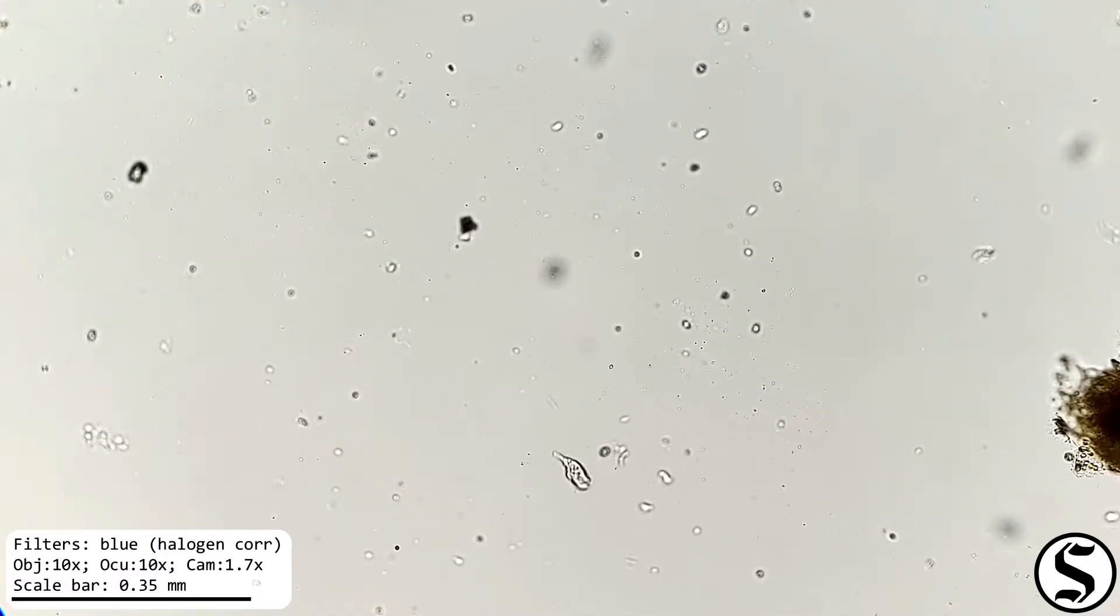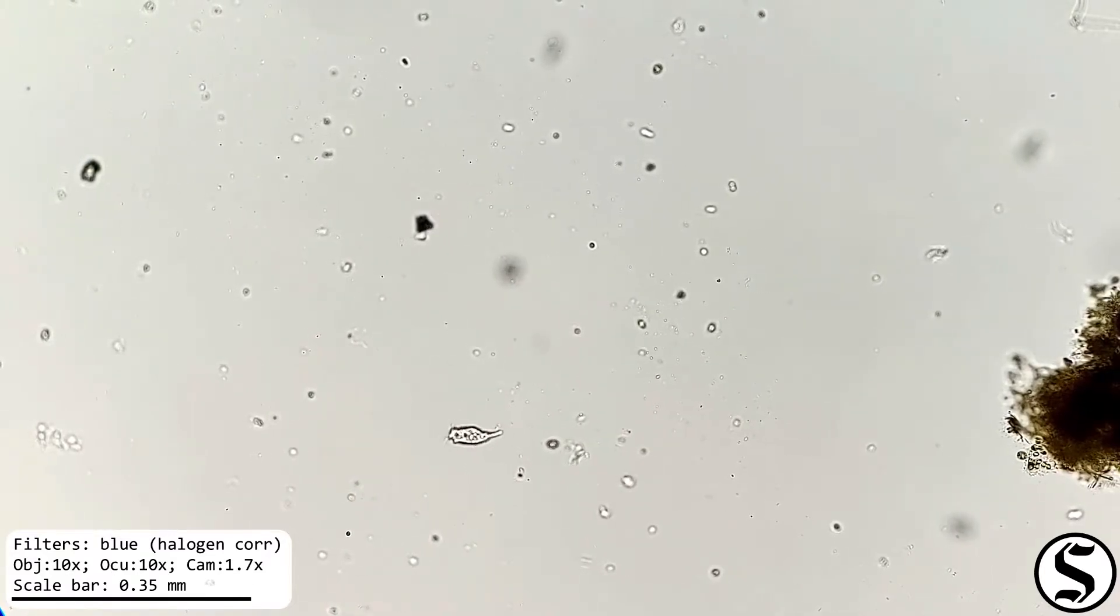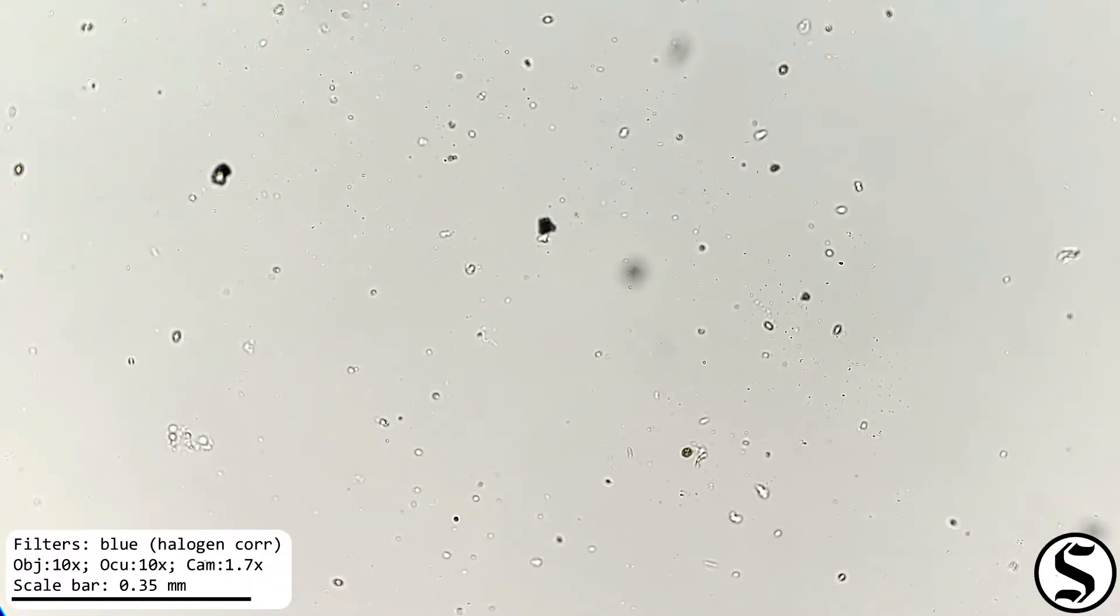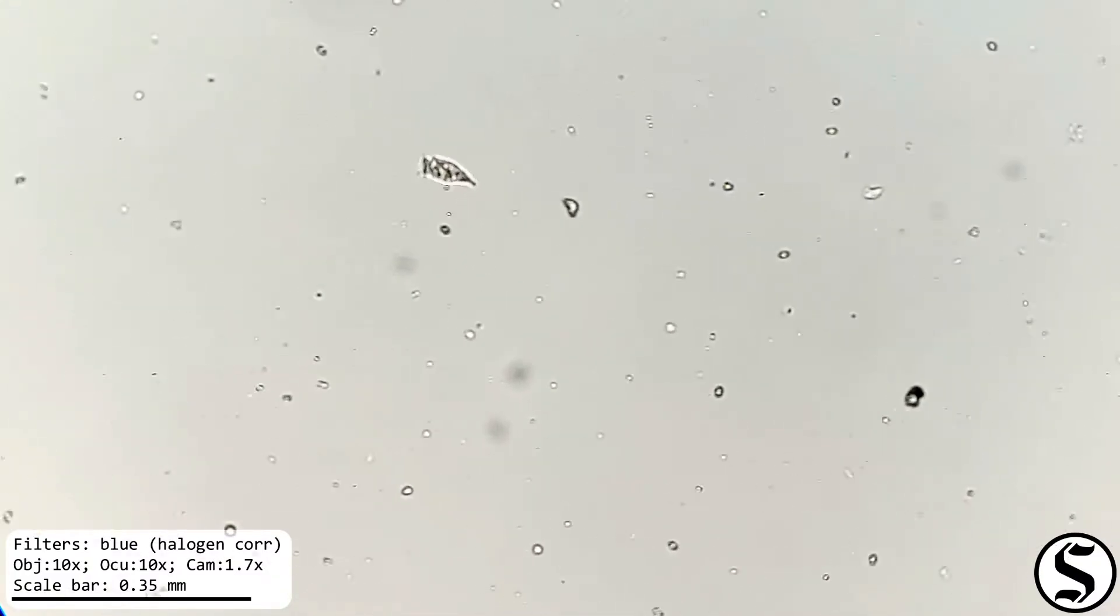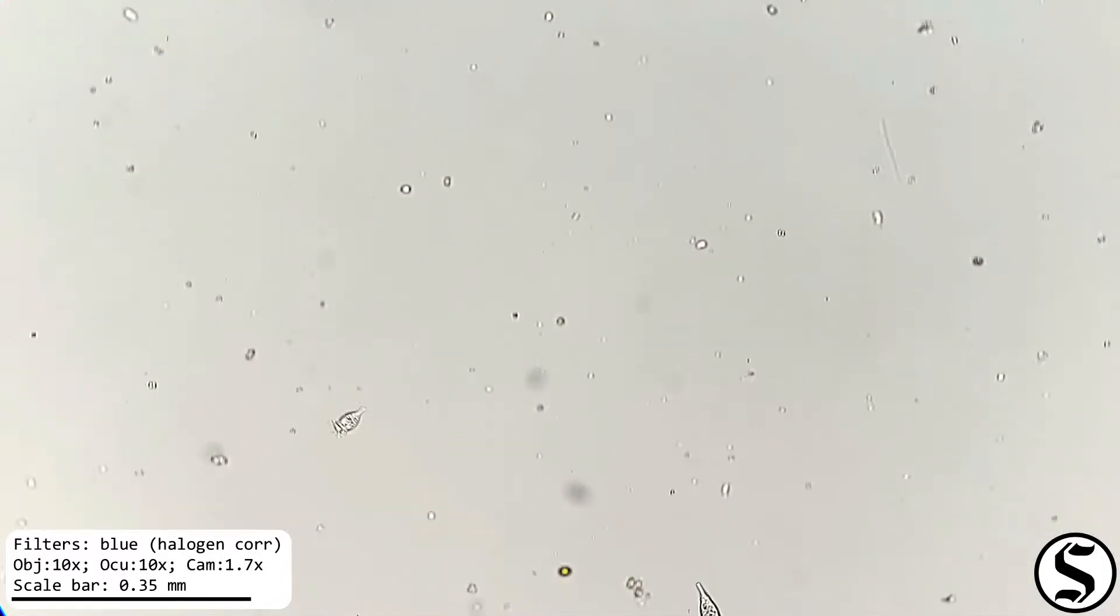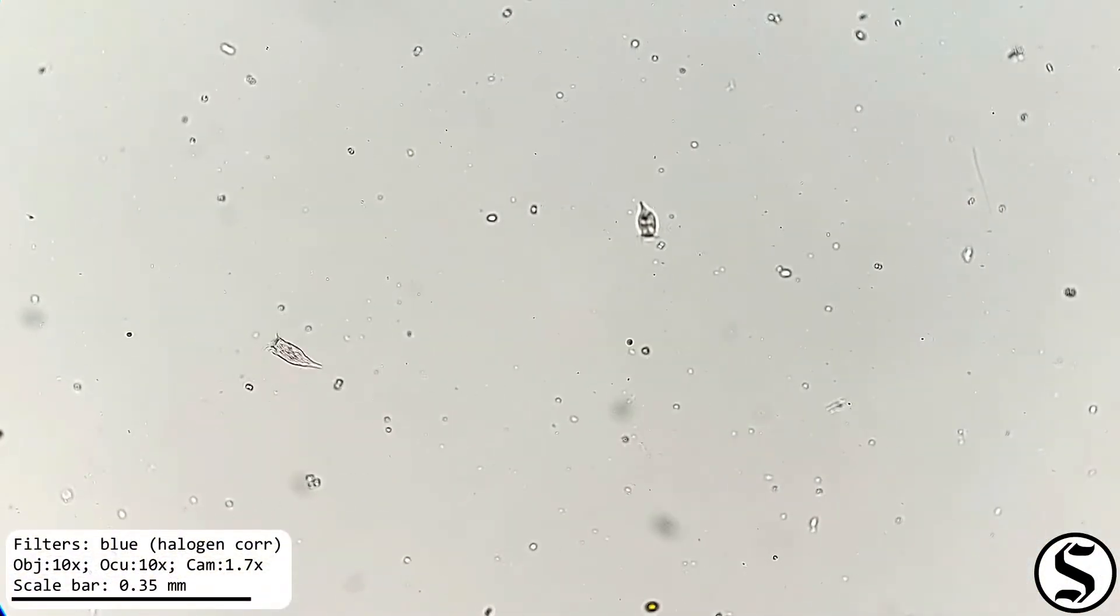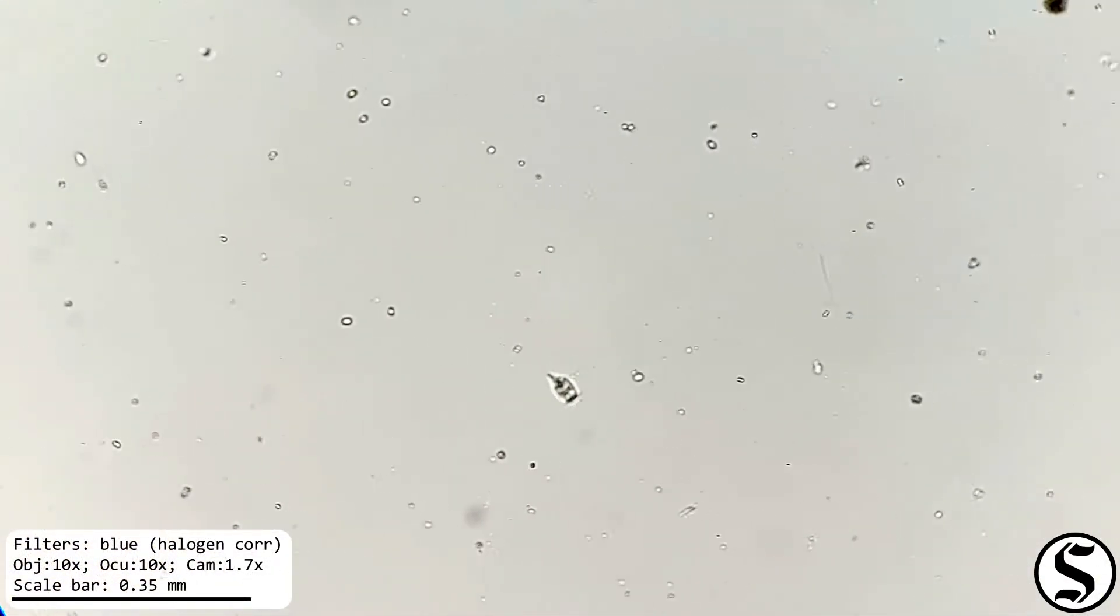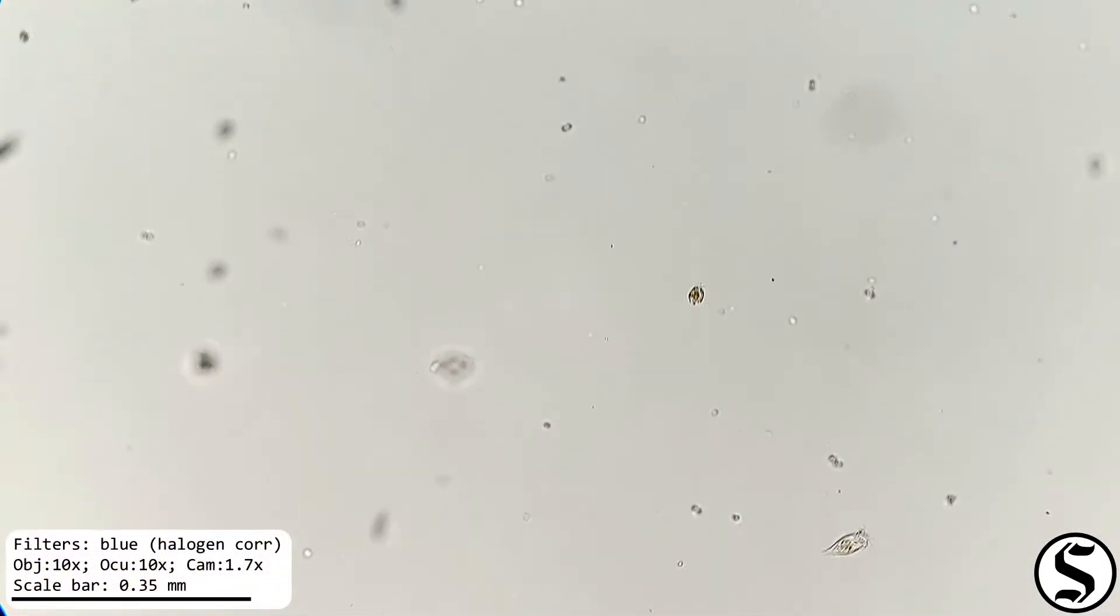Well, they can definitely swim around with those cilia on their head. And there goes another one. A little collision there.